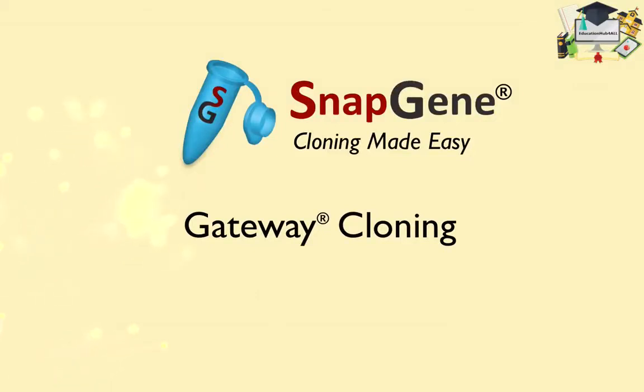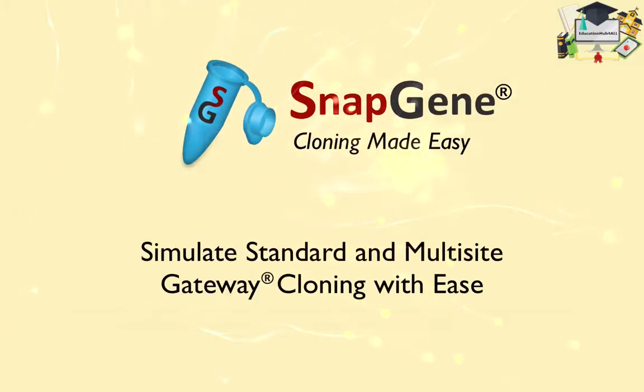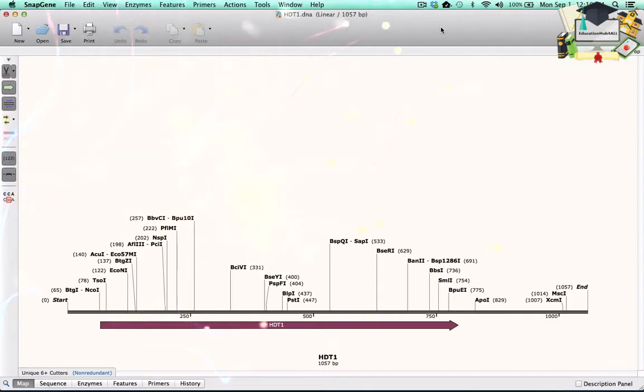Gateway cloning. SnapGene allows you to simulate standard and multi-site gateway cloning with unprecedented ease. Just specify the fragments to be stitched together, and the software will design suitable primers. As an example, I'll start with the simple cloning of a plant gene, cDNA, into a custom gateway vector.